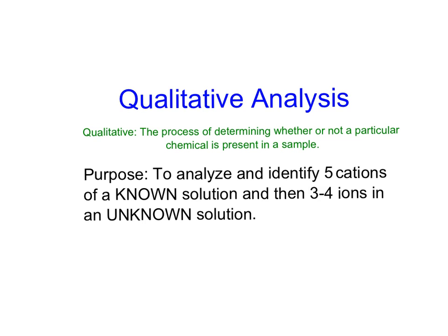It is a qualitative analysis lab. So qualitative means essentially you are determining what you have, not necessarily how much of it you have. It's what qualitative means. You're determining the quality. What do you have?